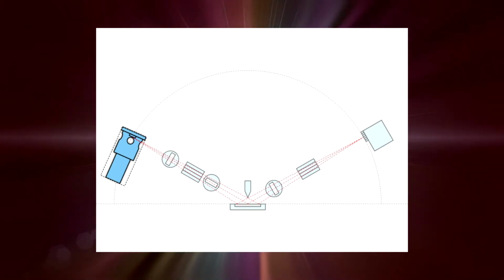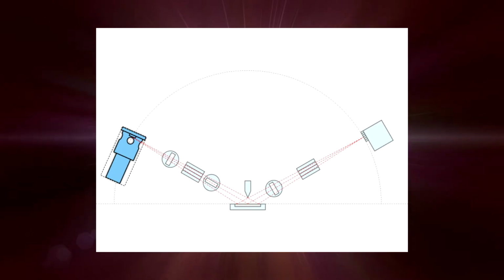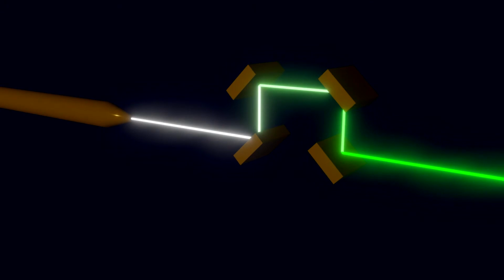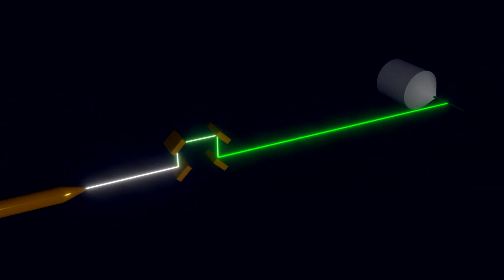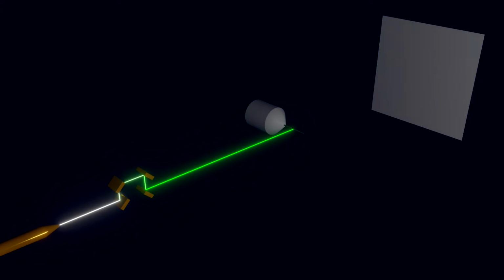Let's start by taking a close look at the differences of the signal we get from a synchrotron using a 2D image plate detector and compare it to a conventional capillary configuration. On a synchrotron, a narrow polychromatic white beam comes from the storage ring and is shaped by a collimator. It then passes a monochromator and reaches the sample as a thin, parallel and perfectly monochromatic beam, where it illuminates a small section of the sample in the capillary. The secondary beams generate diffraction rings, which are projected on the image plate detector.